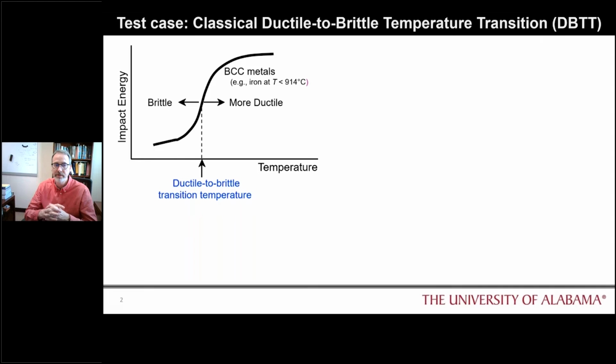So with that in mind, we took two general off-the-shelf materials. One was a 1095 steel, shown here in the center, and to the far right, we looked at a pearlitic gray cast iron. In both of these conditions, we form this pearlite microstructure within the grains, but we also have some other phases. In the 1095, these large dark contrast grains are simply cementite, and in the cast iron, because we have a higher concentration of carbon, we produce this fibrous looking carbon phase as well. But within the grains of both materials, we have that pearlite microstructure.